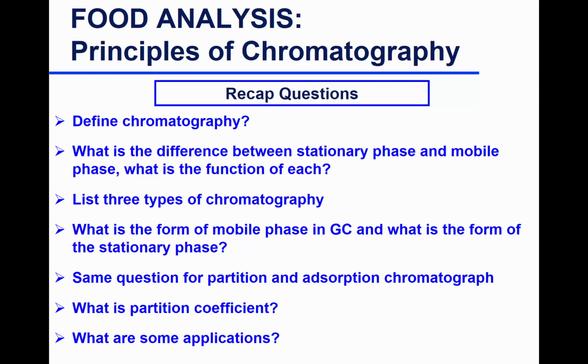Okay. What are the 3 types of chromatography? Nico. Gas chromatography, liquid chromatography, and superfluid or supercritical fluid chromatography. Yes, thank you. When I ask for types, this would be a very common question in a quiz or an exam. What type of chromatography would you use? What mode of separation would you use? Okay, so what type? First you would say HPLC. Mode of separation, reverse phase chromatography. Okay, so yes, so types of chromatography: gas chromatography, supercritical fluid chromatography, and liquid chromatography.